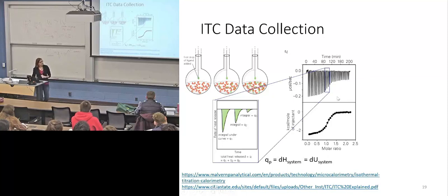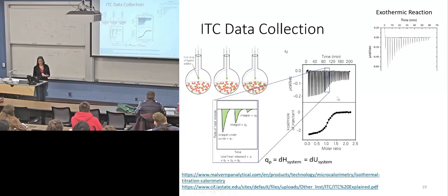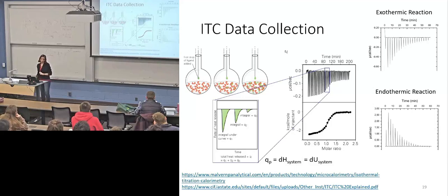Okay. So this is the exothermic reaction. Can I use ITC for an endothermic reaction? And if so, what does the data look like? It flips over, positive now. Yeah, sure, some stuff will react and it draws in heat. It's an endothermic reaction. So then the instrument is supplying heat to that cell to, again, just keep them at the exact same temperature the whole time.